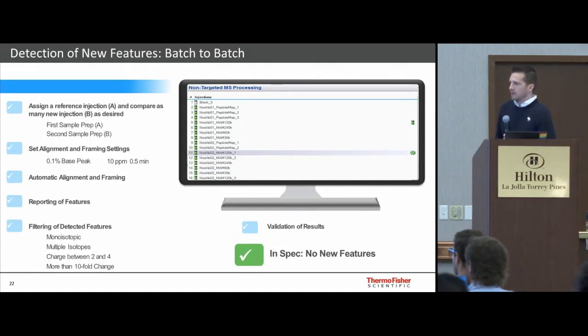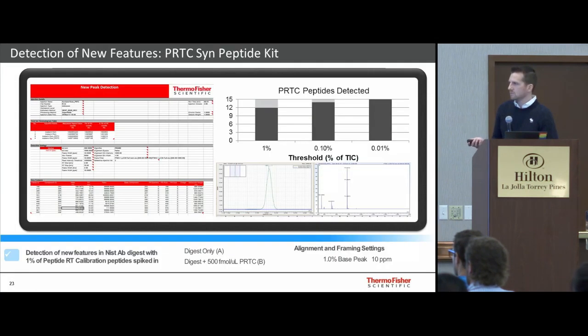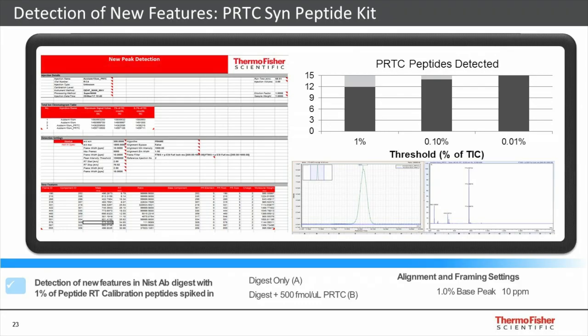Finally, we have the non-targeted processing. So I'm going to skip these two in favor of this one. This one you have to click a bit. Okay, so we did a 2-week stress study at pH 8, right? So I'm not sure what to expect.